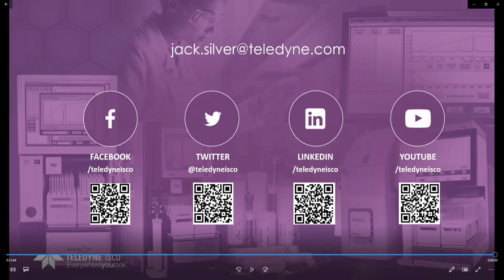Does each run need a new column? Are columns reusable? The reverse phase columns and the amine columns are definitely reusable. There are some customers who try to reuse the columns by flushing them out with 2-propanol and storing them. The problem with that is that 2-propanol is a strong solvent and the column has a memory effect. So when you reuse the column, the peak retentions change between runs.